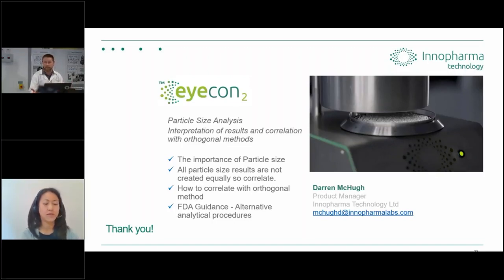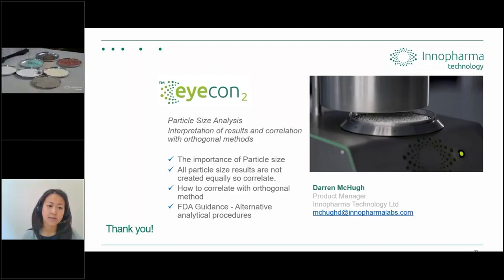Once the material is within the size range, which we've seen in the spec sheet earlier is 50 to 5,500 microns, and the material is free flowing, we can measure it. So that goes back to the presentation and representation, how we integrate the ICON 2. The image we just inserted is just a couple of examples of material that you can measure. We're looking at powders and solid bulk materials, so they're all either free flowing, either white or off-white in nature, because of the illumination method, the red, green, and blue LEDs. We need to be able to illuminate the material.